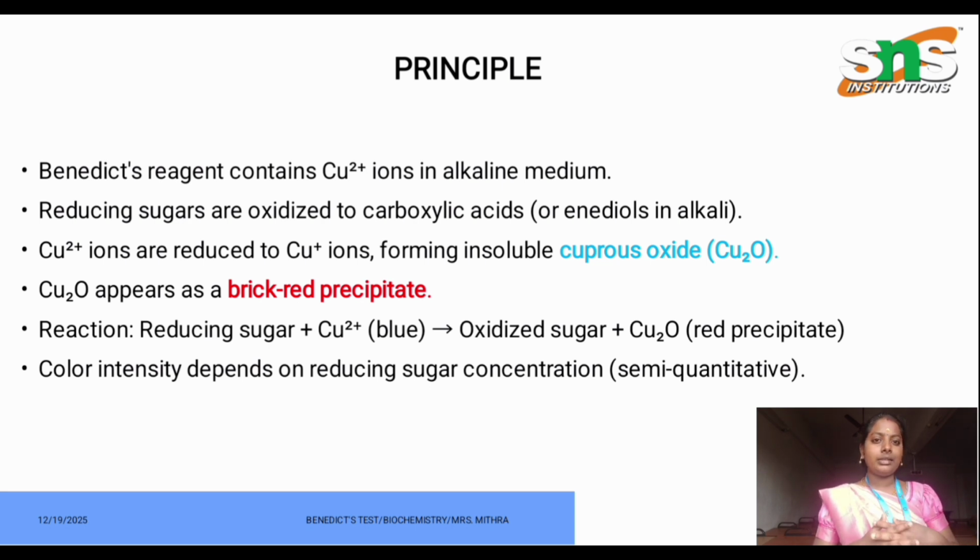And this color intensity depends on the reducing sugar concentration. So whatever the sugar level present, the color intensity will vary. The more the concentration of reducing sugar, the more the color intensity, and less sugar concentration leads to less color intensity. And this is the overall principle which leads to the color formation from blue Benedict's reagent to a brick red color precipitate in the solution.